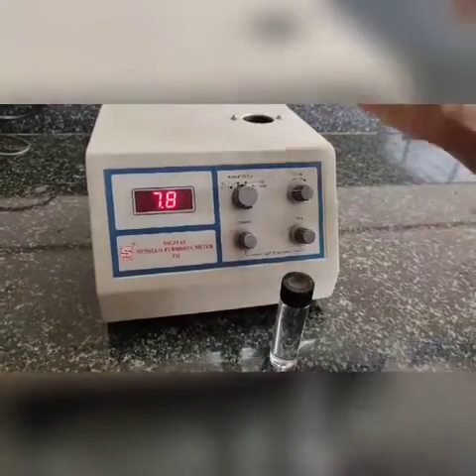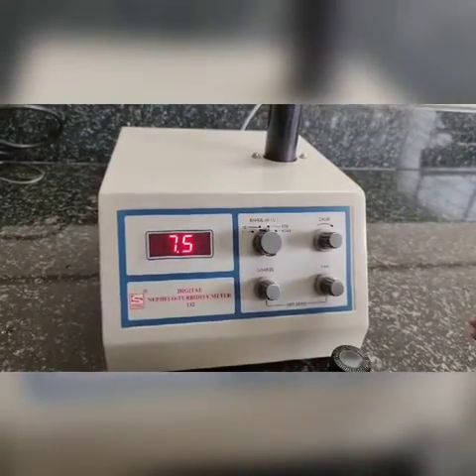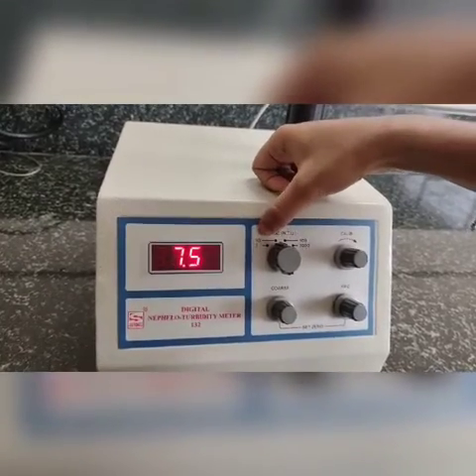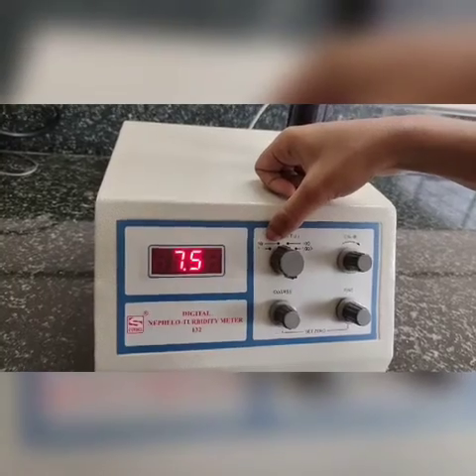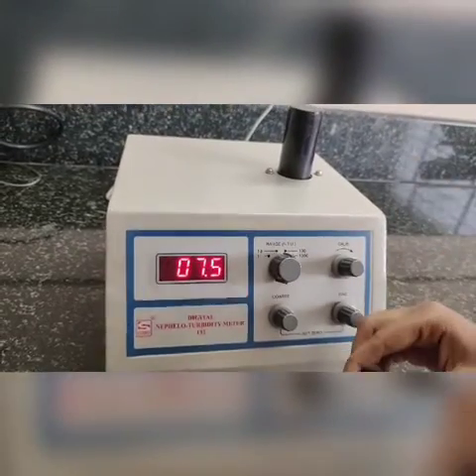Take out the sample, then fill with 10 NTU solution, then 100 NTU, and 500 NTU — the same procedure is followed for each. So we have calibrated for 1 NTU, 10 NTU, and 100 NTU. For 100 NTU, rotate the range to the 100 NTU setting.